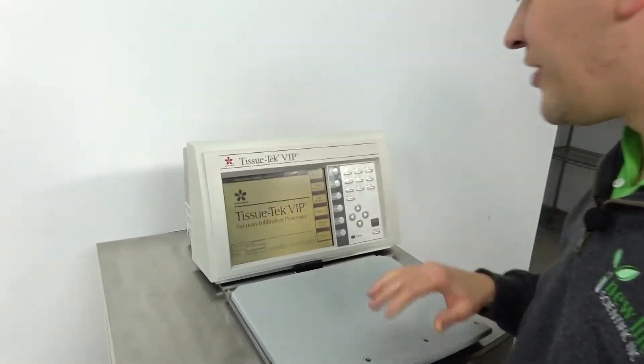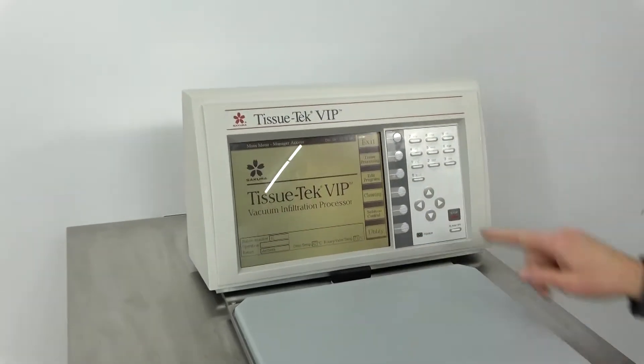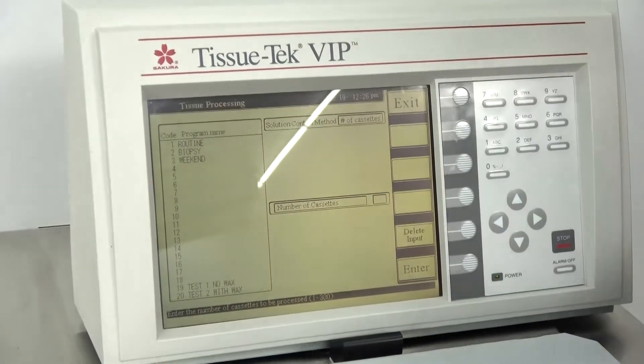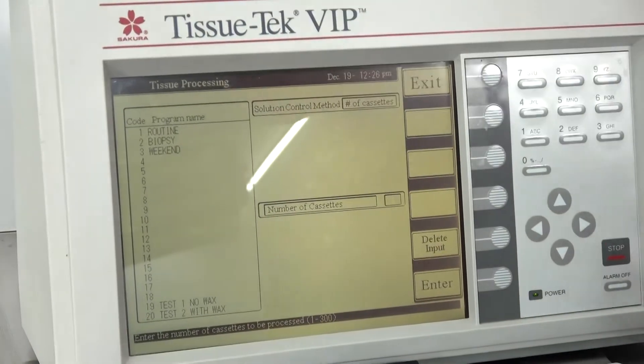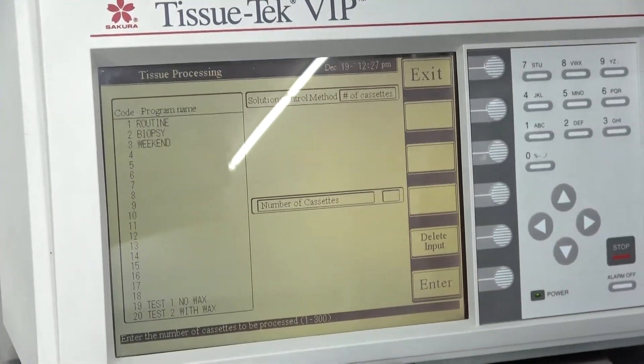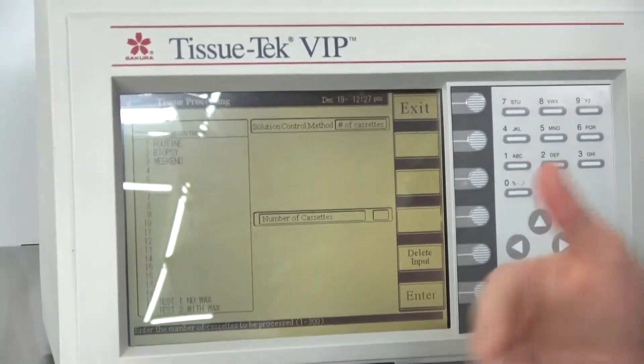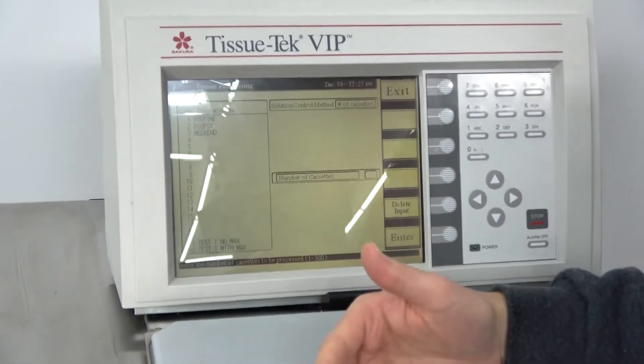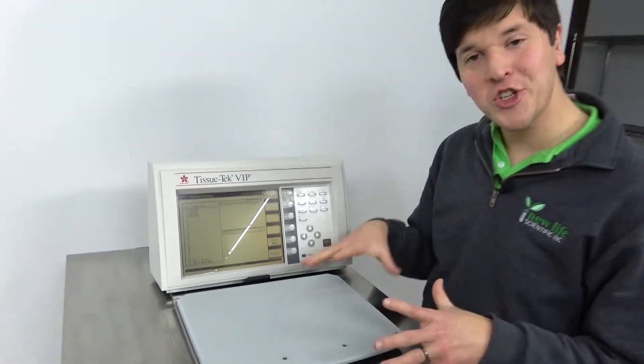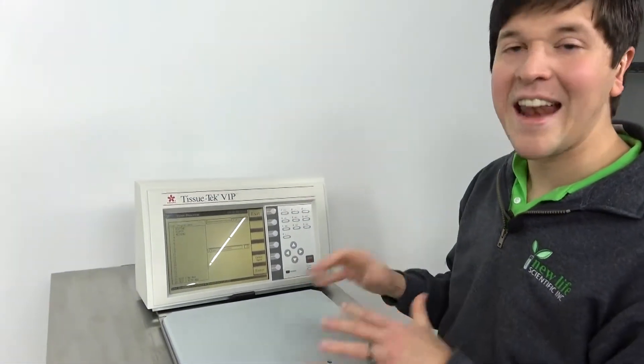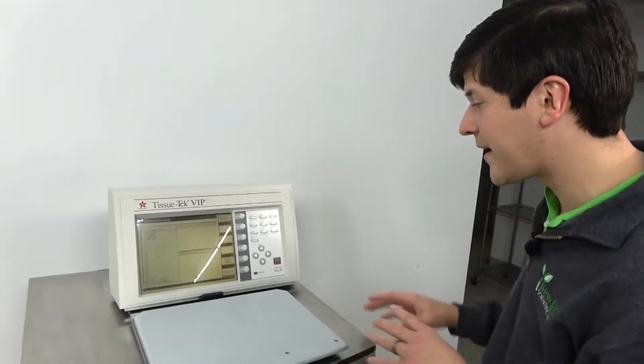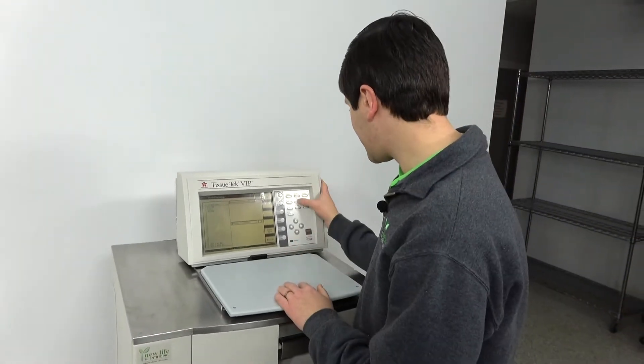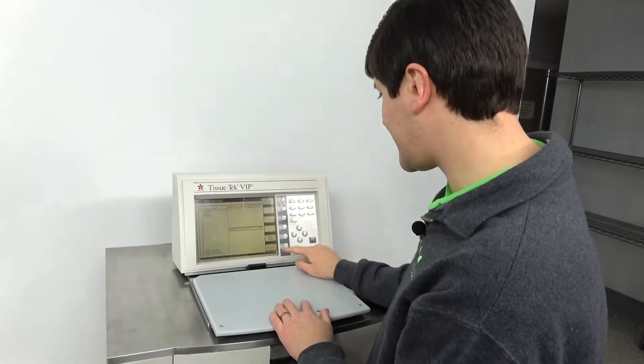And you can adjust those levels. Another feature with the VIP-5 is you can have a set end time for the tissue processor. So say that you want to start cutting samples the next morning or embedding samples the next morning at a certain time and you don't want the finished tissues sitting in here for eight hours after they finish at one in the morning or something. You can choose a set end time. So I'm just going to choose a certain amount of cassettes here.